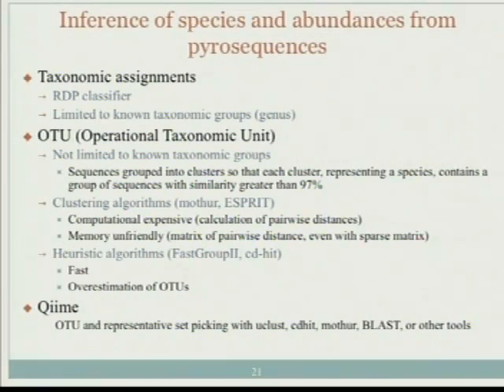It's not comparable to the human genome. I don't remember the exact size. But if you just want to run BLAST, it will still take quite a while if you have a huge query data set.